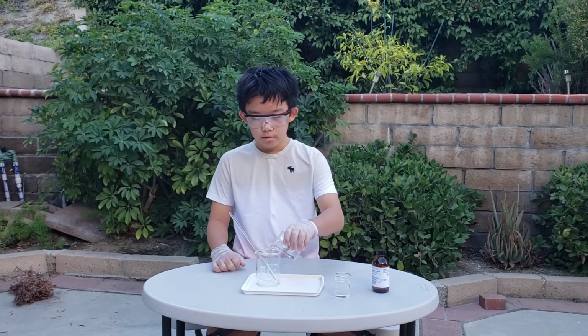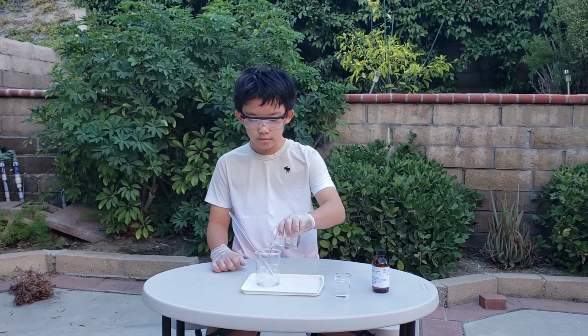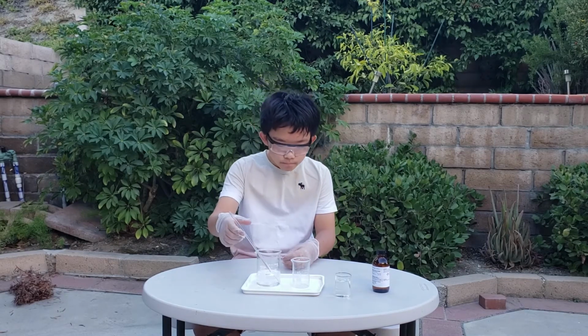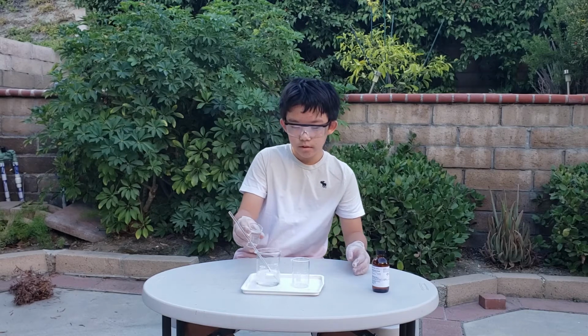Now, let's do our experiment, snow globe in a beaker. First off, let's pour our saturated salt solution. Saturated just means that you can't dissolve any more of a substance into a solvent, in our case, water. So saturated sodium chloride means that you can't dissolve any more sodium chloride into water. Next, we add hydrochloric acid. Remember, this stuff is corrosive, so handle it with respect. Ready?